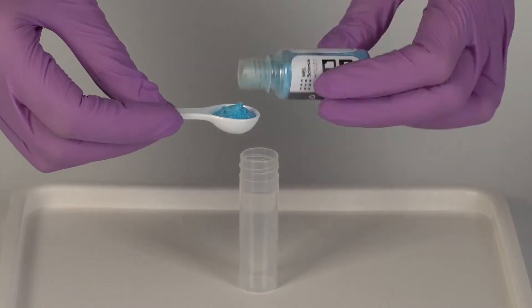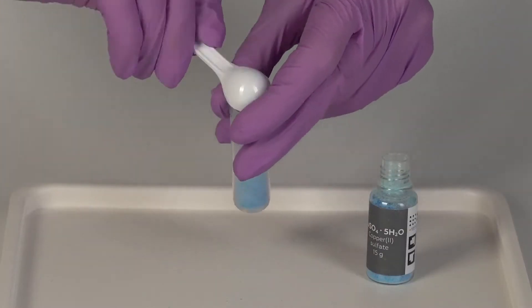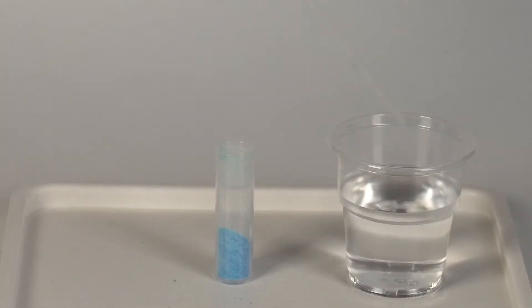Take the vial and add two big spoonfuls of copper sulfate. Using a pipette, add 10 drops of water.